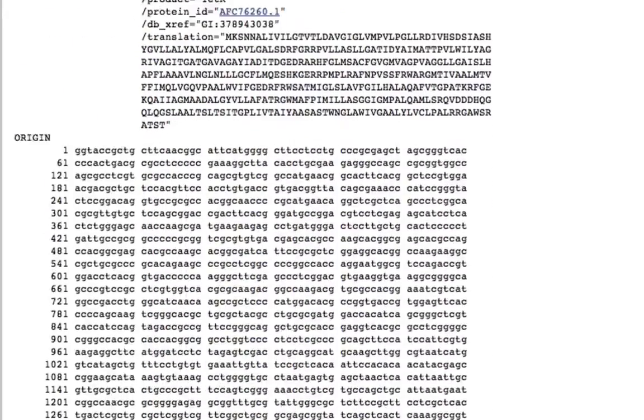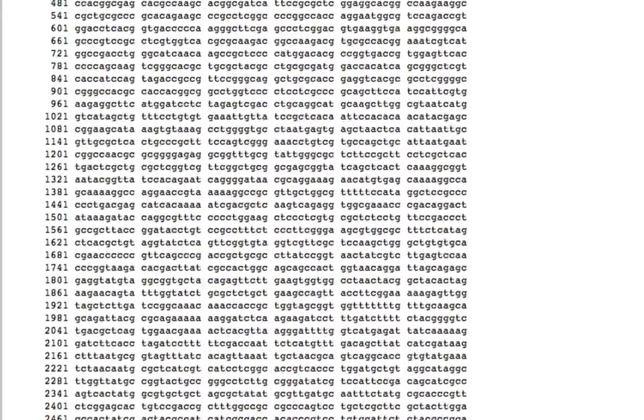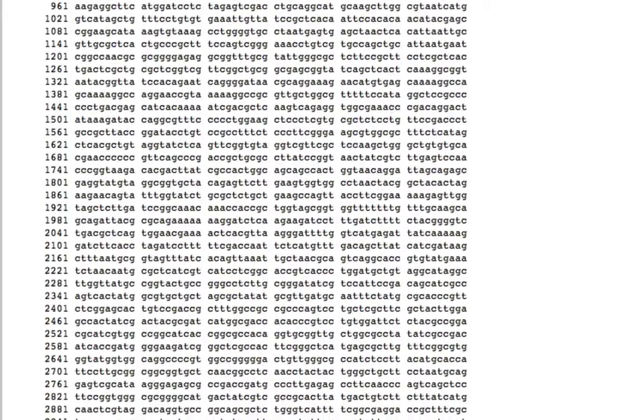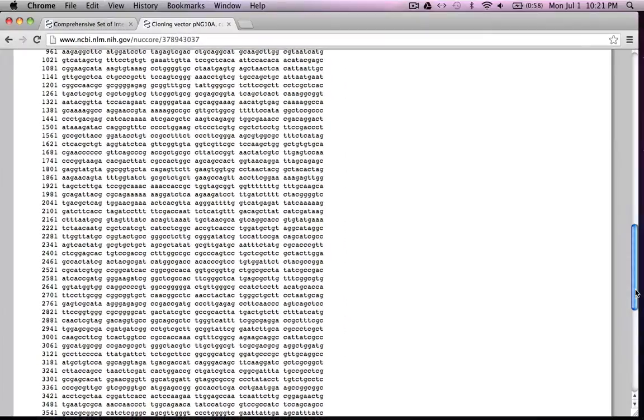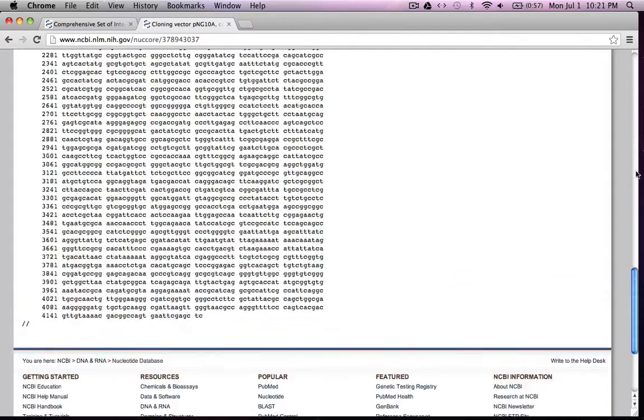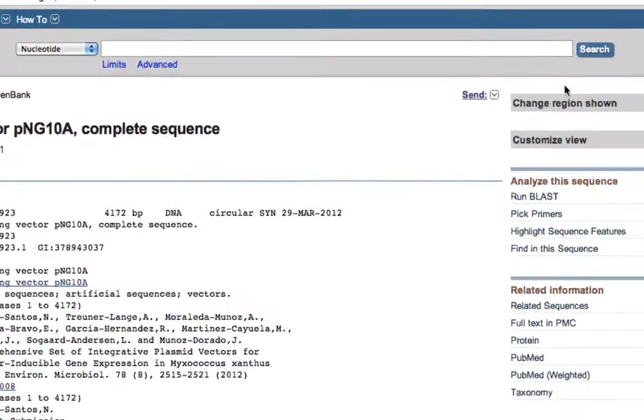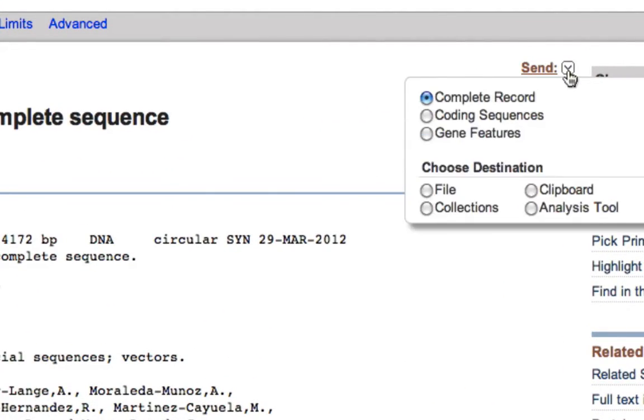This is the entire sequence of the plasmid. Basically you want the entire sequence in your software so that you can manipulate and design your cloning strategies.